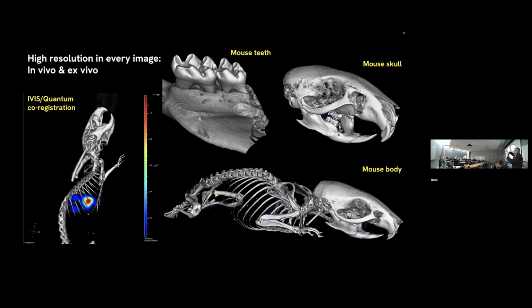There's osteoclastogenesis, and as a result of that, the bone resorbs. And what do you measure? How can you use micro-CT in this phenomenon? You are using some landmarks, like this landmark, which is called the cemento-enamel junction. And these landmarks allow you to measure the amount of bone that you have lost over a certain period of time in experimental versus control. And with this, you can be very quantitative, very sophisticated.